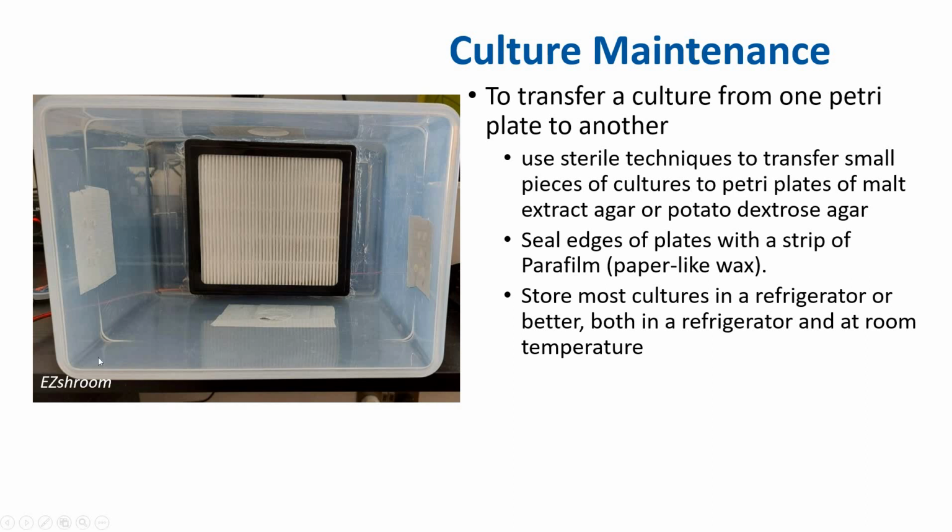This is a HEPA filter and a tote. This is basically your laminar flow hood. You can make this relatively cheap.